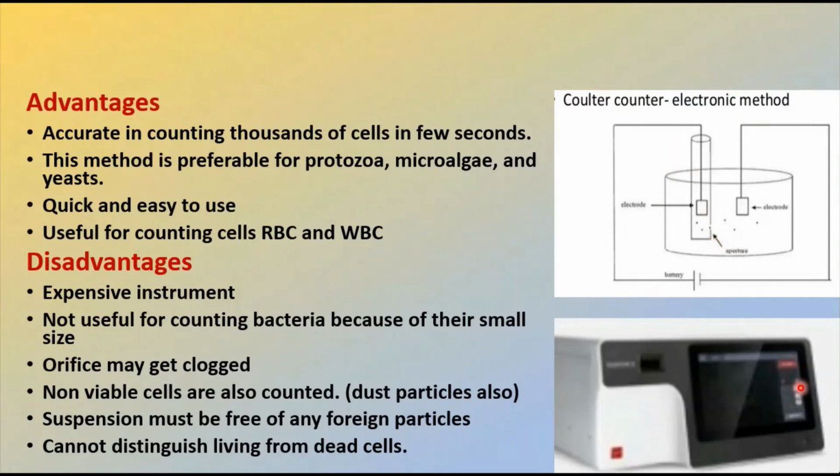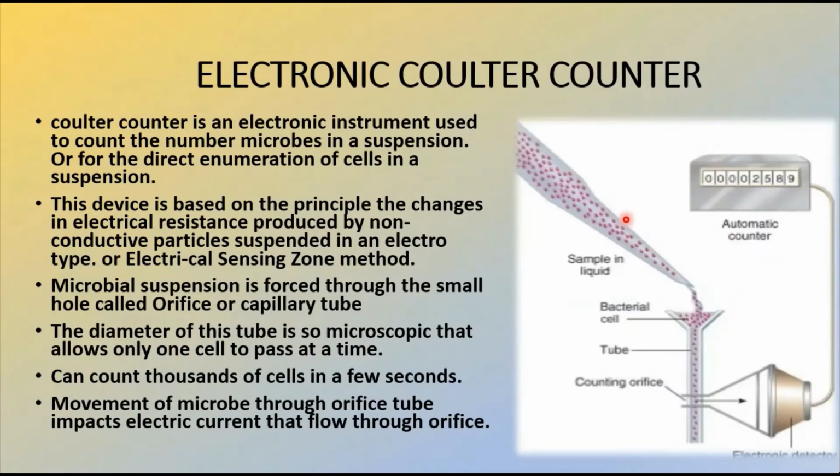So we are going to have the voltage, and thus the pulse height is going to be proportional to the volume of the solution displaced by the particle. And now the cells are going to be counted, and if a control volume of liquid is passed through the aperture, particle concentration can be calculated.